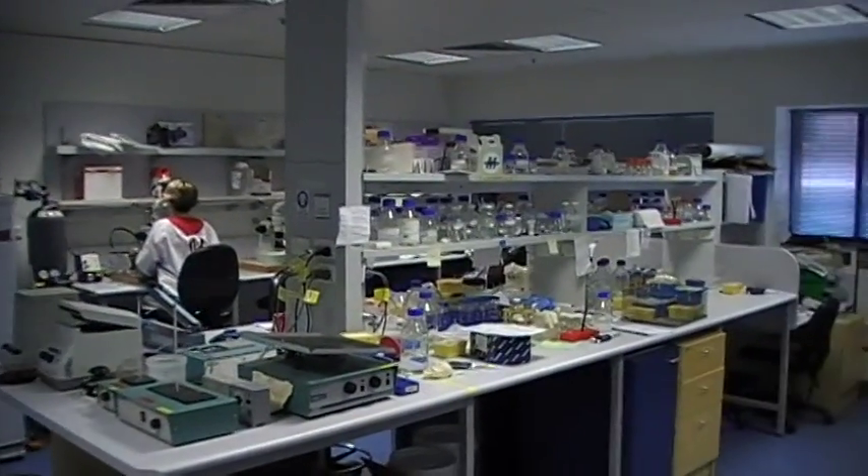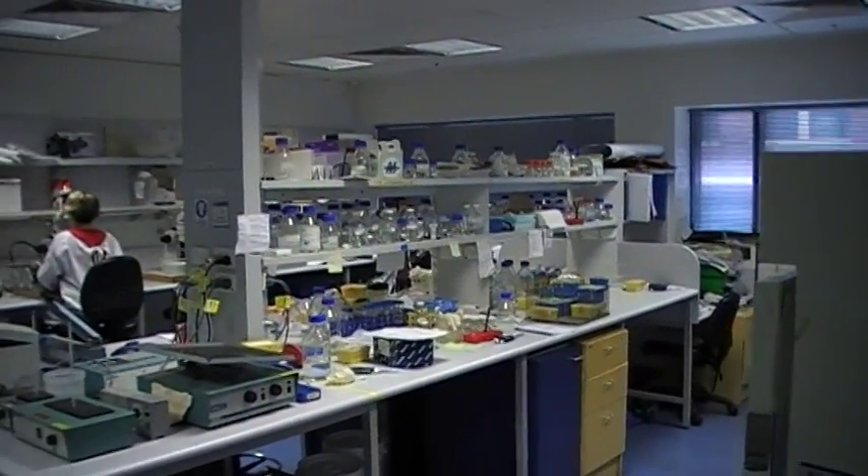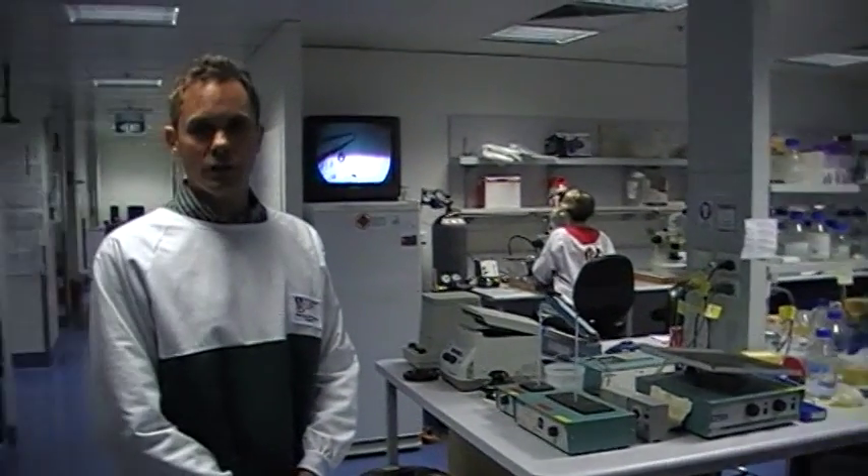If you look around here you can see a lot of tubes and chemicals on the benches, and these are the things that we use to cut and join DNA and other chemicals in order to regulate gene activity.